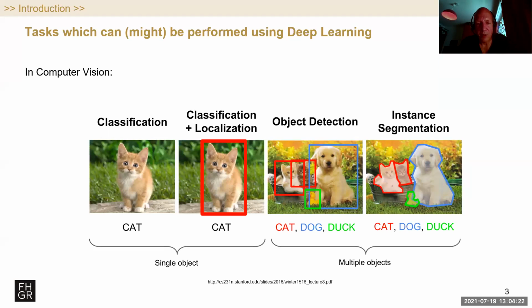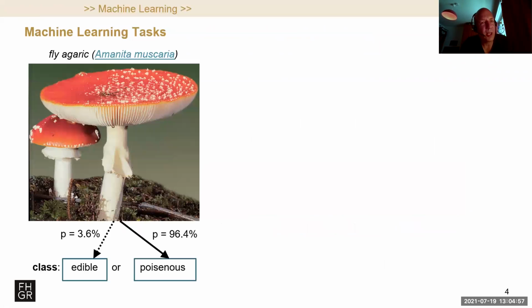We would find their region of interest, or if it's possible, we're going to be more precise and not only have a proposal region of interest as we are seeing here, but something that is sort of pixel based. We're going to assign a certain set of pixels to each of these objects that are being presented. This is, of course, what we would like to achieve.